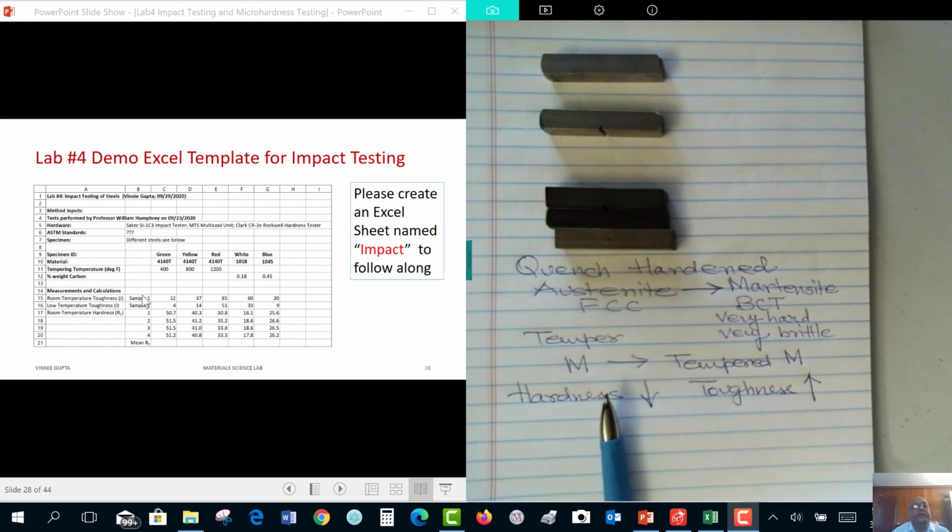In any case, if you were taking an in-person lab, you would have had to transcribe all these values from your handwritten data into the spreadsheet. So I hope you take the time to build the spreadsheet and enter this data. So let me fire up my spreadsheet.